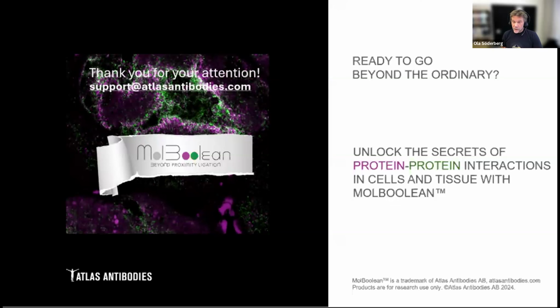And also when you have a very mixed population of cells, you have maybe cells that overexpress a protein. So if you have millions of copies of one protein, they will always be close together. All the different methods to look at protein interactions have a distance threshold when they record a proximity event or not. So it's not a physical interaction.